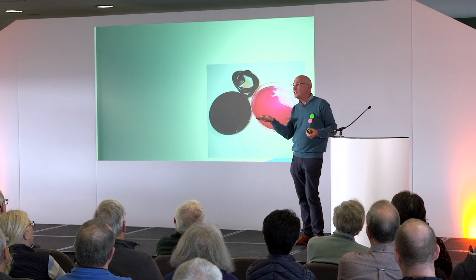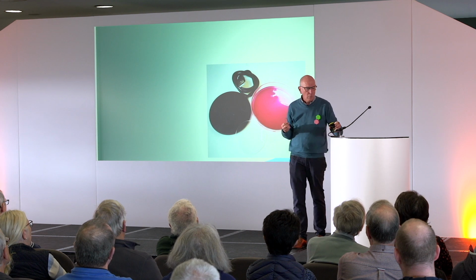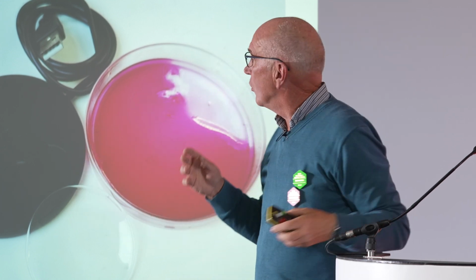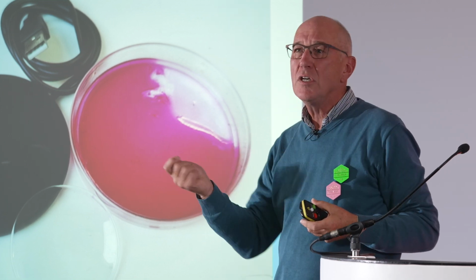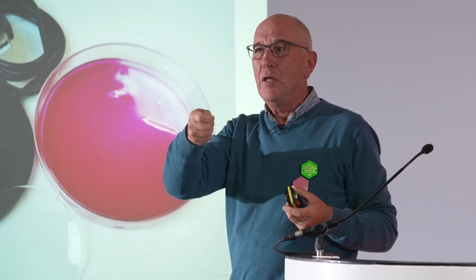So what you do is you stain a pollen to bring out the colour. What the stain does is kind of expand the shell of the pollen so that it makes the surface easier to determine. So you've got a colour stain, but you need to heat the stain for it to be taken up by the pollen.